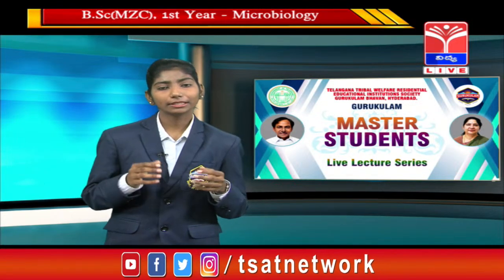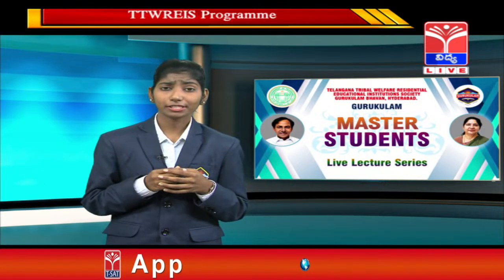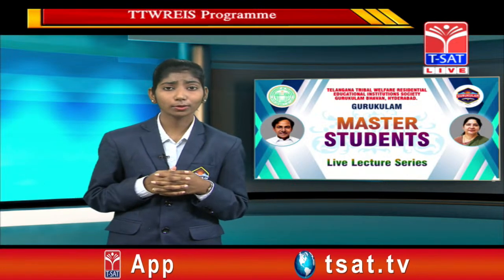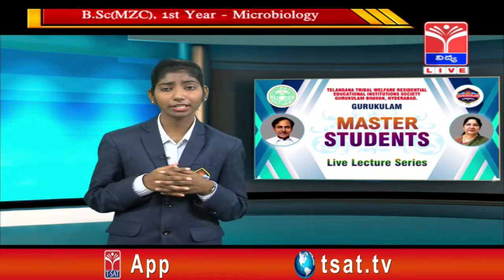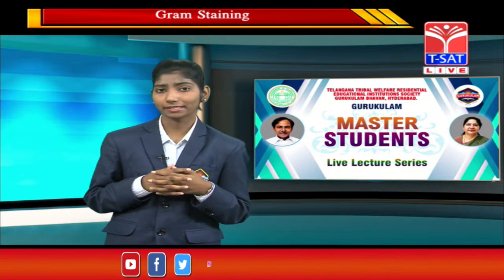So these are the different types of bacteria which we have, and gram-positive and gram-negative bacteria are again divided into major types. They are gram-positive cocci and gram-positive bacilli.